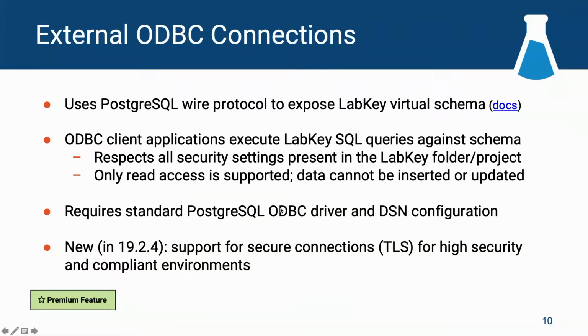The client application can use the standard Postgres ODBC driver and then configure a data source name for it to connect to a LabKey instance. We have also lately added support for secure encrypted connections via TLS so that we can use it in a highly secure and compliant setup.